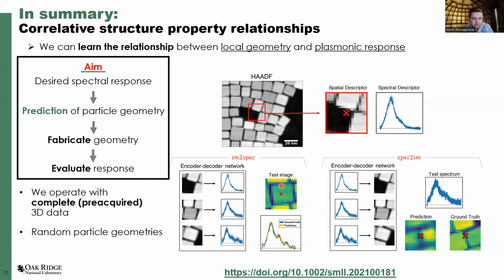As a microscopist, typically, we're looking at what we are given by a sample grower. It would be nice if we could bump that in the direction that we want, in the sense that we can do a little bit of the fabrication ourselves to get some geometry that we want, because there's a lot of randomness in the particle geometries and how they're dispersed and so on.